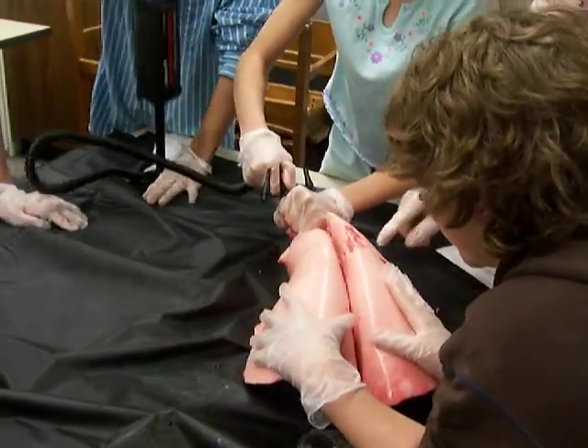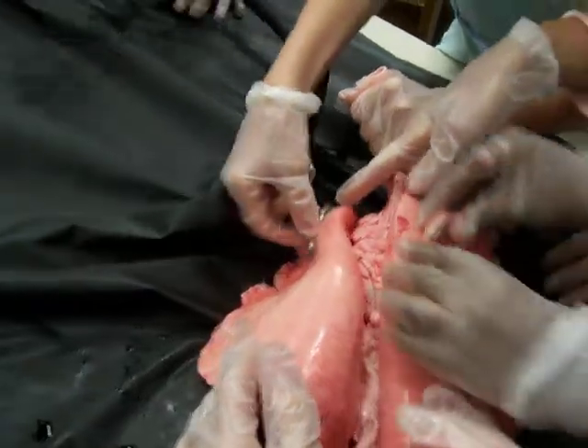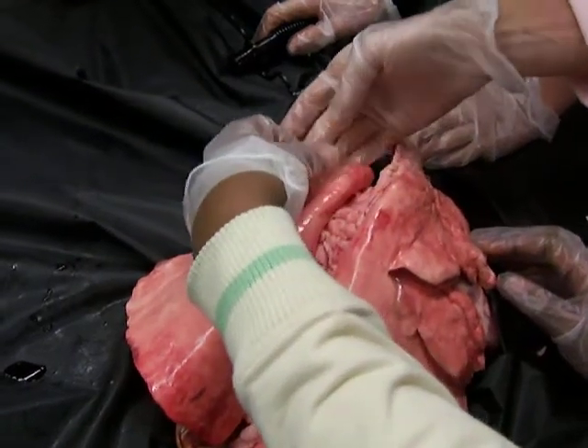Oh my goodness, we got him totally inflated. Oh now look at this — okay stop, stop, look at that. Do you guys know what that is? This is called a bleb.